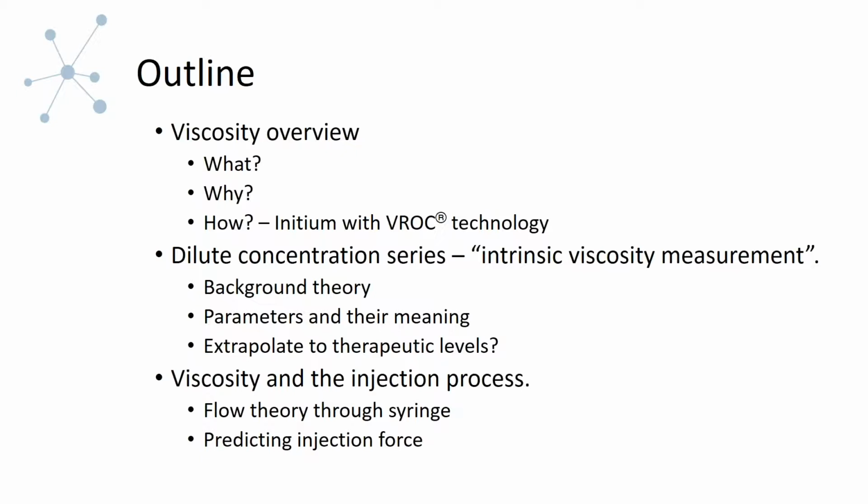A little hint, we're interested in talking about some details about the Initium with the VROC technology. And because we're interested in talking about what they refer to as intrinsic viscosity measurements, which are really just a concentration series of viscosity measurements in the dilute regime, we're going to give some details about that. There's going to have to be some background theory here so that you can understand the types of parameters that you can extract, and that these parameters have a physical meaning relating to your sample, so that they're quite informative.